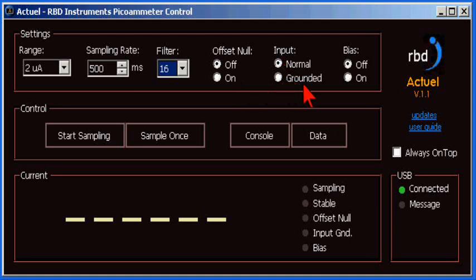The input can be grounded or shorted when not measuring current. This is useful for when the 9103 is connected to an Auger or XPS spectrometer specimen stage, which keeps the sample from charging.